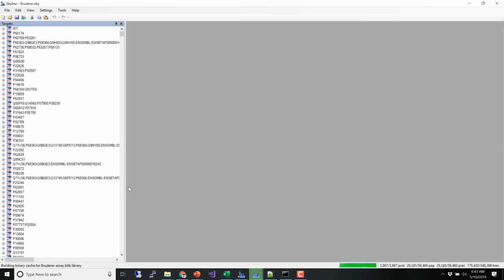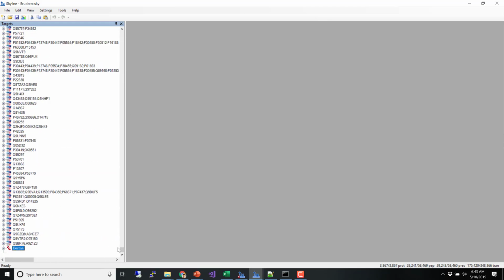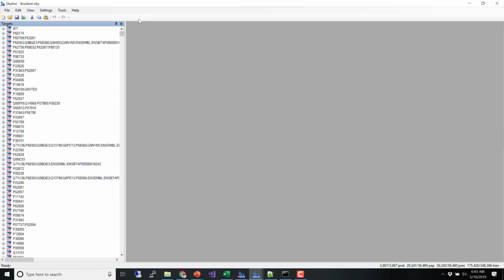It's basically that same template that you created yourself with 350,000 transitions, IRTs at the top, a whole lot of peptides, and the decoys. So this is me creating exactly what I walked you through creating yesterday.